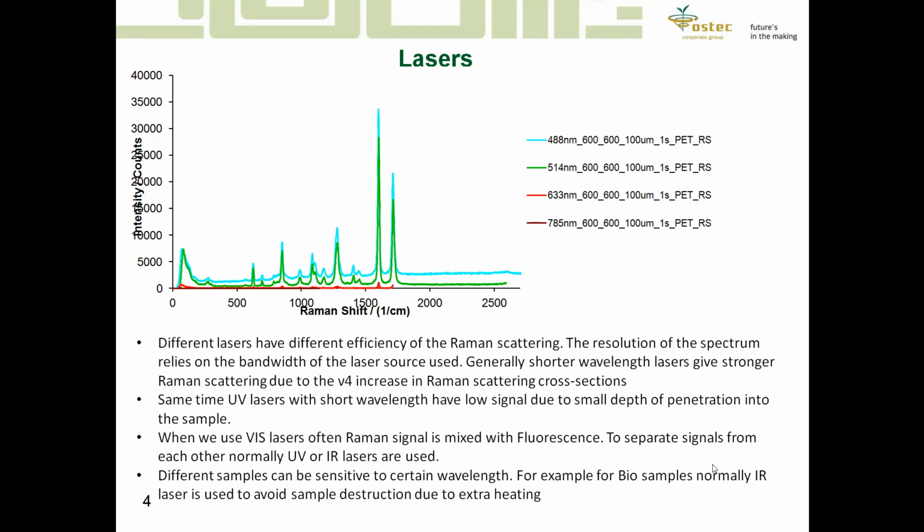Another thing, the Raman signal quite often can be overlapped by fluorescence, and to avoid such masking of the Raman signal, we should choose an excitation wavelength either in the red region or in the UV region.